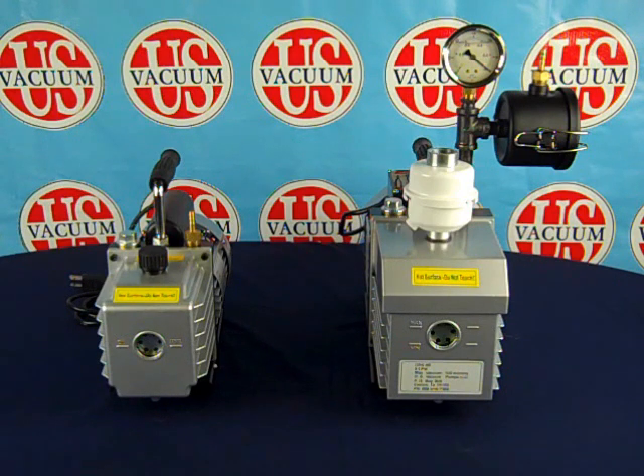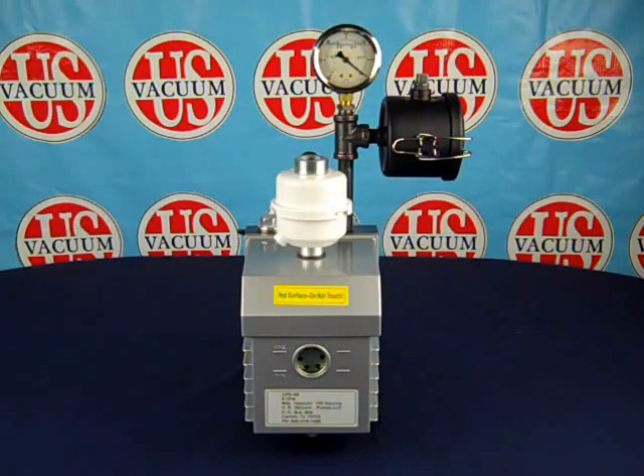All pumps are tested prior to shipment and come with an operations manual and an initial supply of lubricating oil. Here we have the vacuum pump filled with oil and ready to turn on.